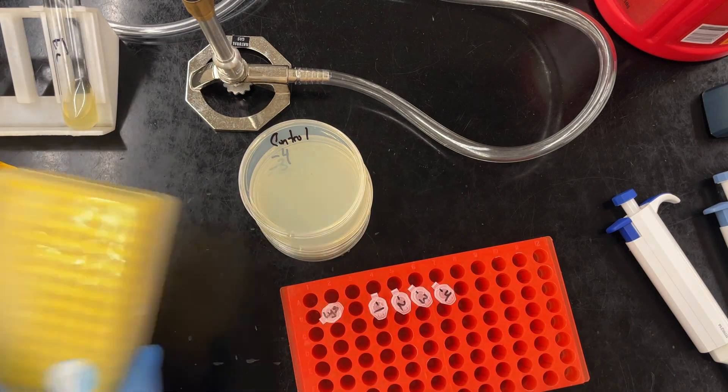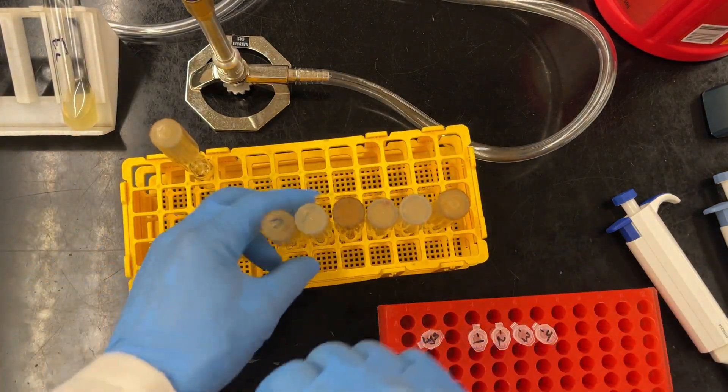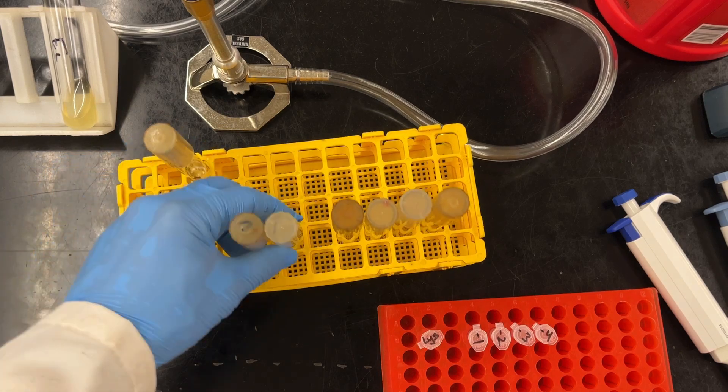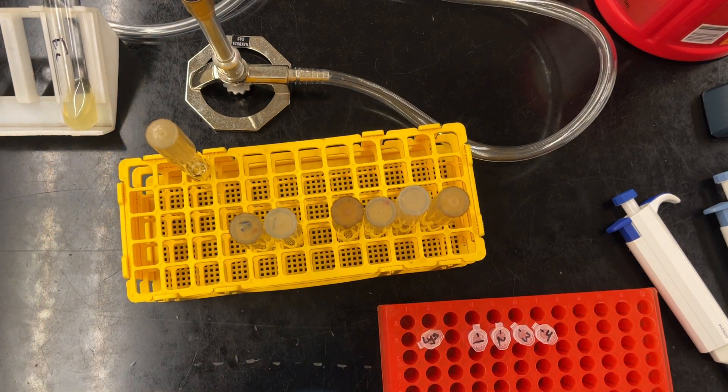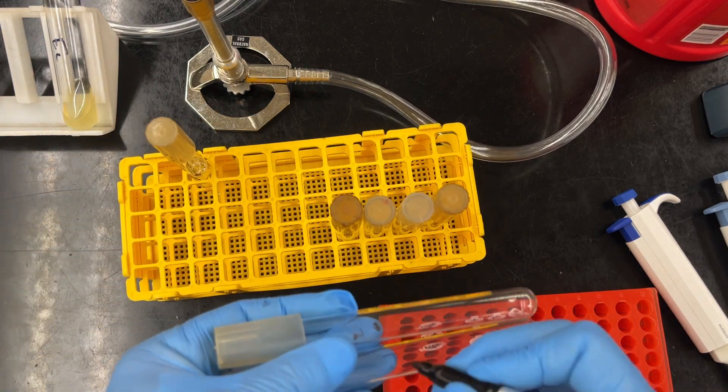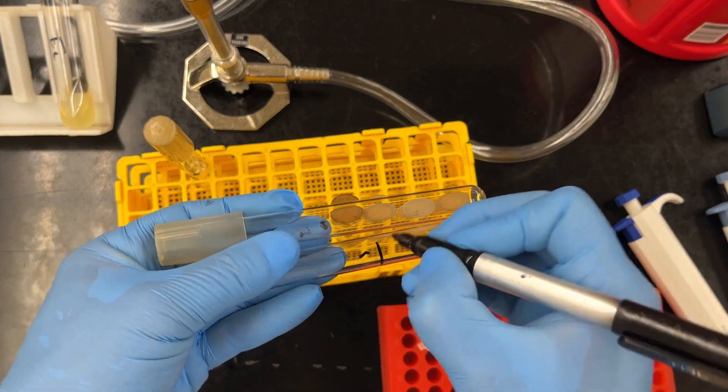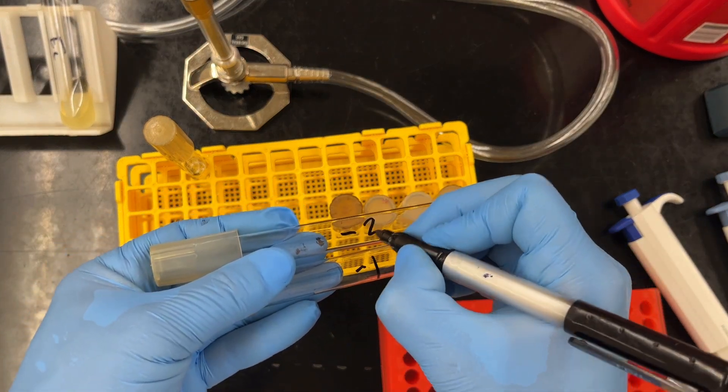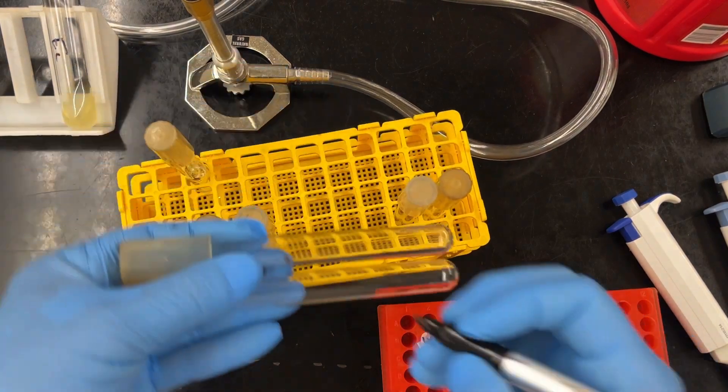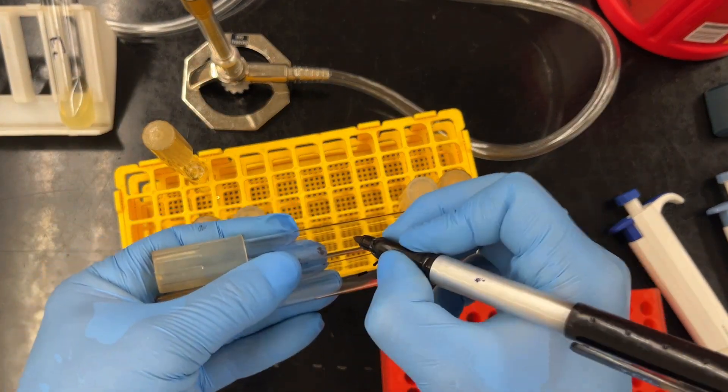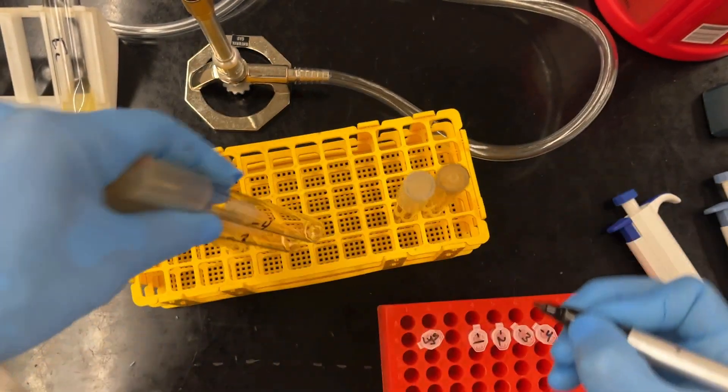When we plate phage, we actually need to give it time to adsorb to the cells, which means attach. So that's what we're going to use these tubes for. As always, we should pre-label. So we're going to write down our plates, our final dilution. So actually, you'll notice I'm going to take out our 10 to the minus 1. So minus 1, minus 2, minus 3, minus 4.